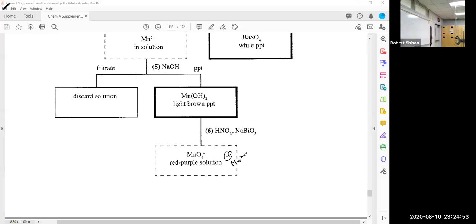But I think you got the gist of the titration. I tried to make it as realistic as possible. If things work out too perfectly, then it's not realistic. In lab, everything that can go wrong will go wrong. So in lab, you have to have some degree of persistence. So, well, anyway, let's stop.